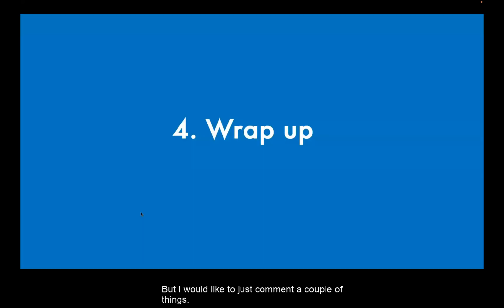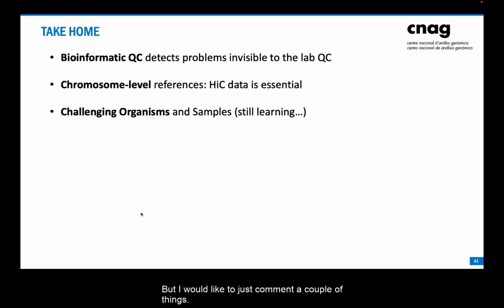And that's all. But I would like to comment on a couple of things. I think the bioinformatic QC is important because it detects problems that are sometimes invisible to the lab. All the metrics, the QC1, for example, metadata can be good, and in the end, we end up having a library with a lot of trans contacts. That happened to us. The same with Omni-C: we see nice digestion profiles, and then in the end, same story, very short cis contacts.